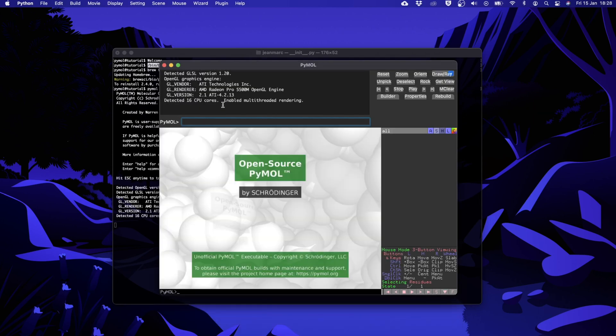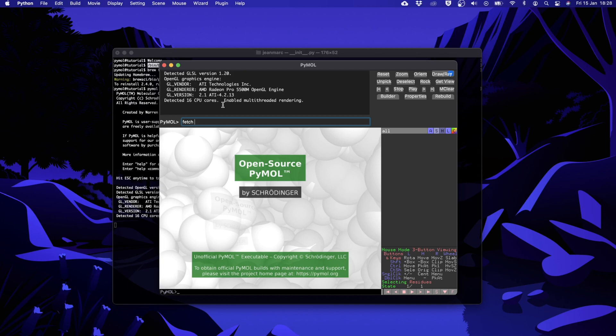For the last part of this tutorial, as promised, we want to load a molecule into PyMOL. This is done through the command line fetch followed by a PDB code. The command fetch works exclusively with the protein databank.